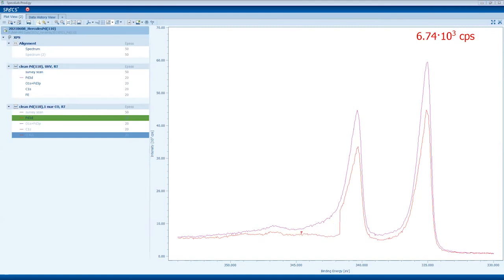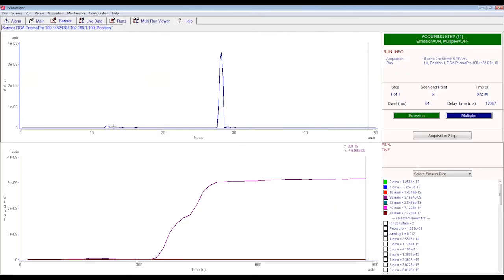I think on the second stage we can try to introduce also oxygen to CO, to see maybe some products. I think palladium at room temperature might also already catalyze something. So here is the CO. This is CO signal 28.